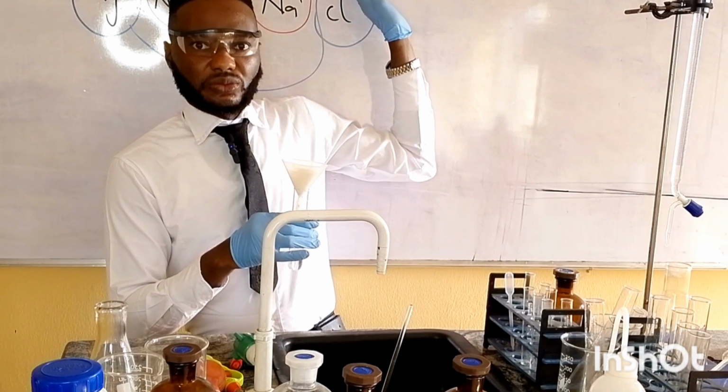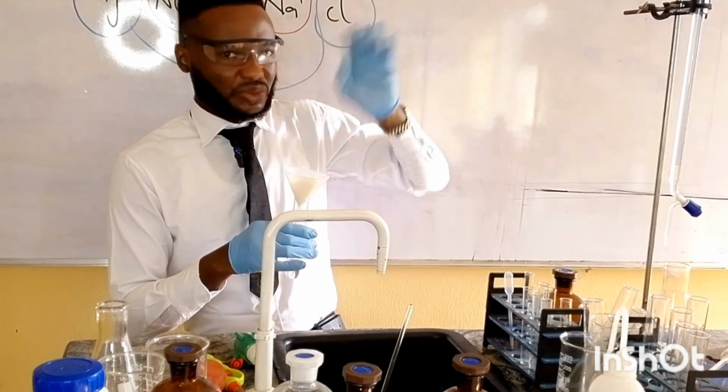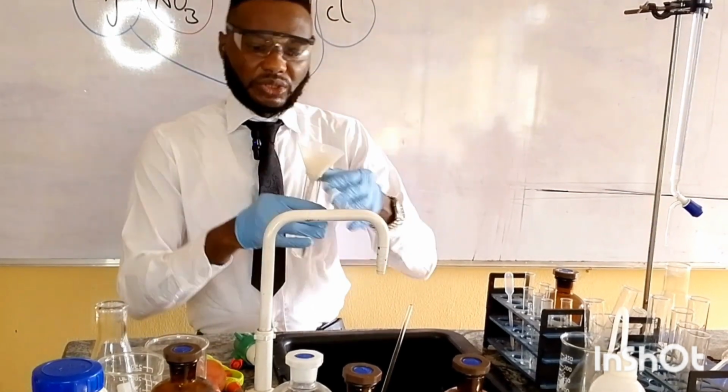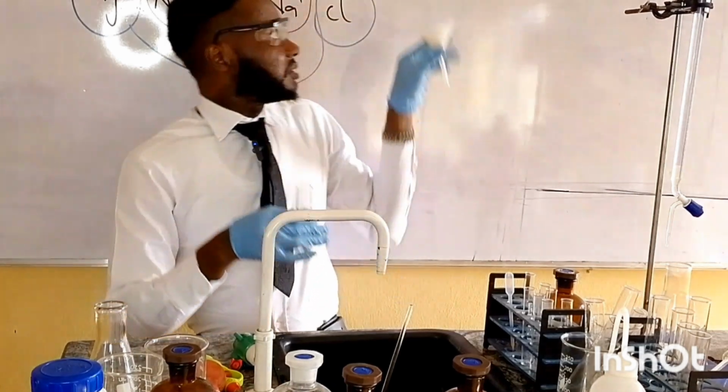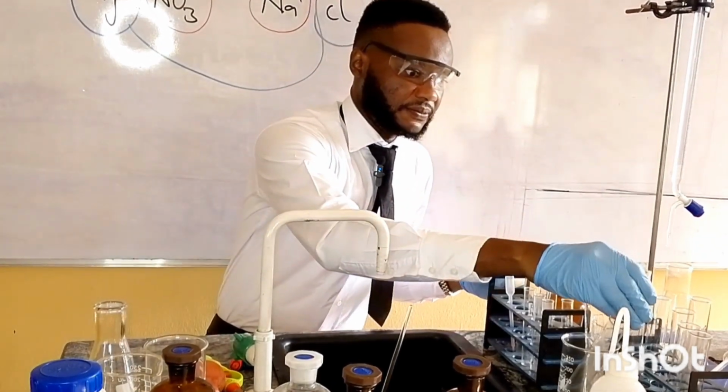It is insoluble. It doesn't dissolve in water. So this is insoluble. This one is what? Soluble. So this is the filtrate. This is the residue. So I can keep this on here.